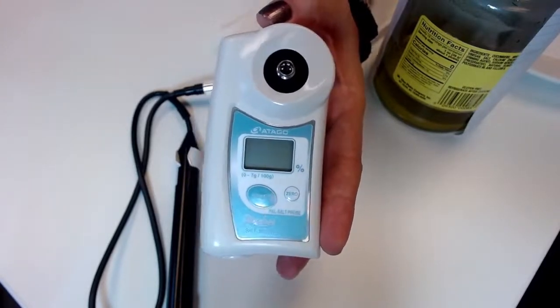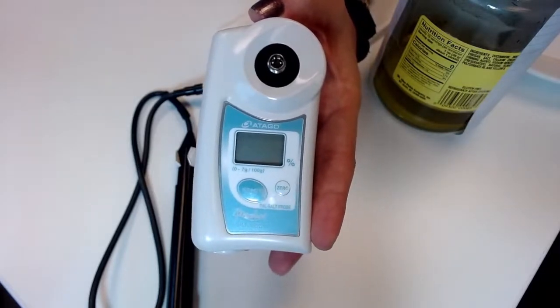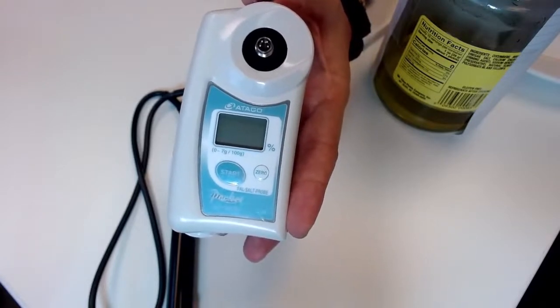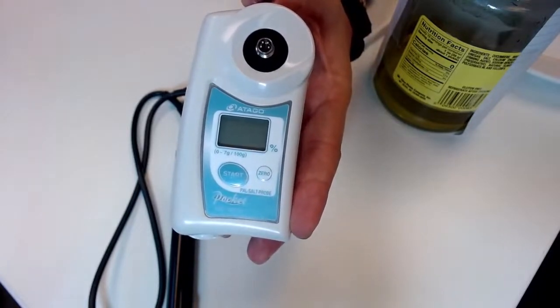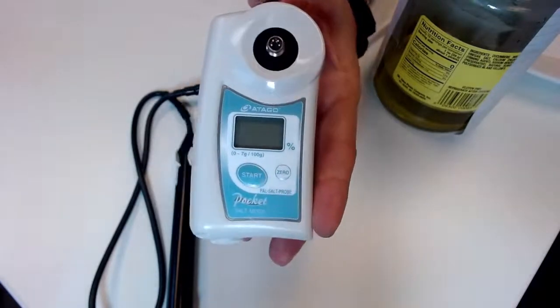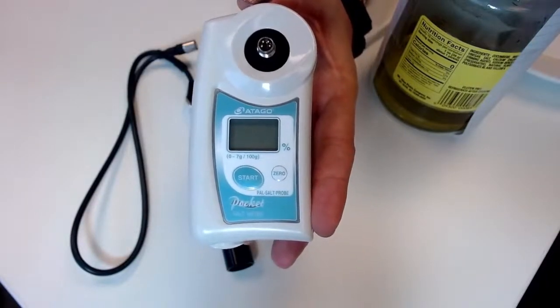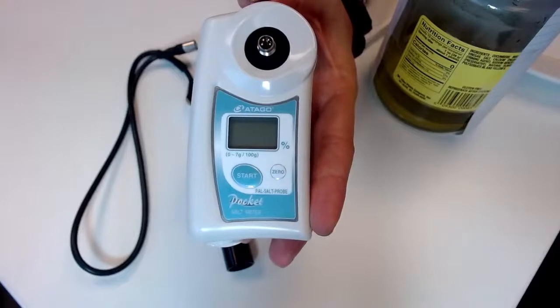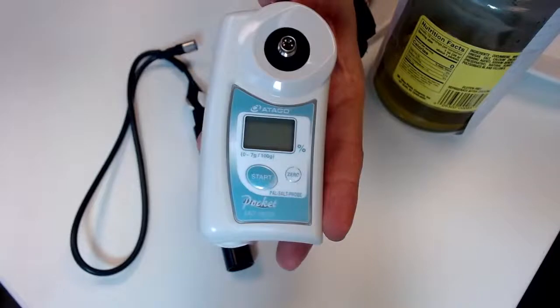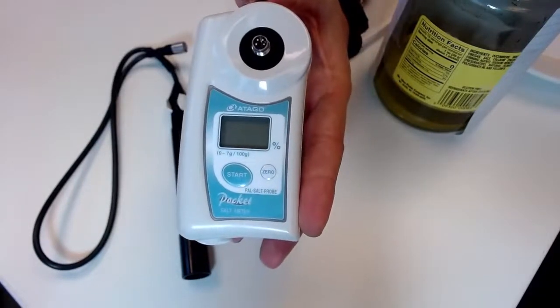This unit is also equipped with a TC feature, or automatic temperature compensation. Temperature compensation is performed when the sample temperature is equal to the temperature of the sensor, or right here. It's important to note that if your sample is warmer or colder than room temperature, the electrode pins need to acclimate to the sample, so you want to wait a couple minutes just to make sure everything is about the same temperature.